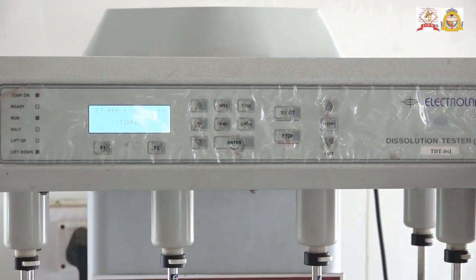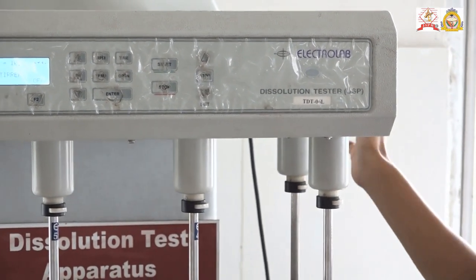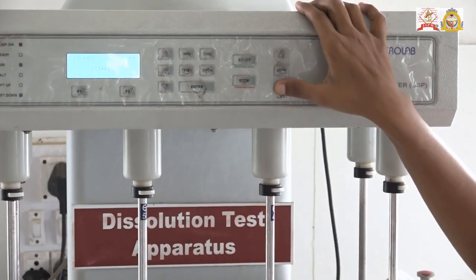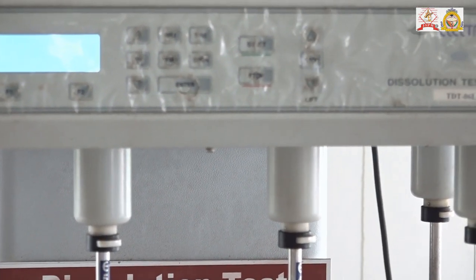First of all, turn the main switch. The main switch of the dissolution test apparatus is behind the apparatus. Start the instrument and lift it downwards to dip the paddles in the dissolution media.